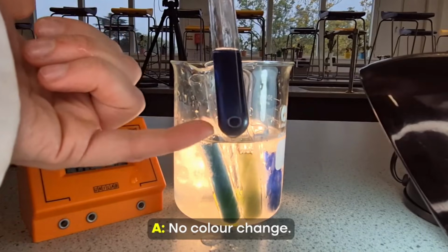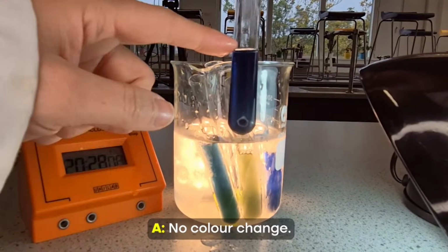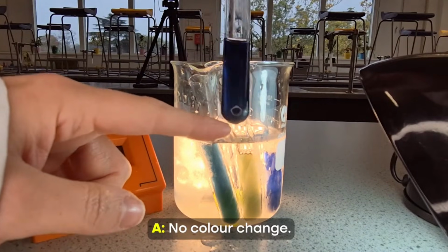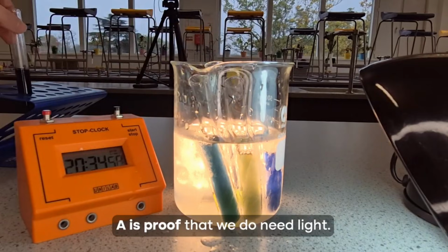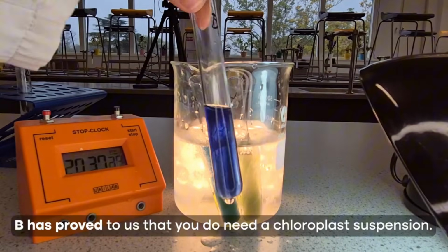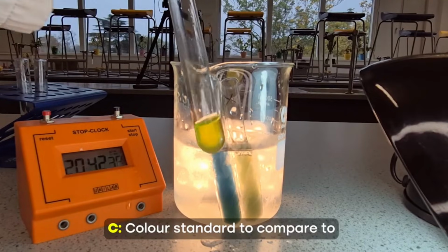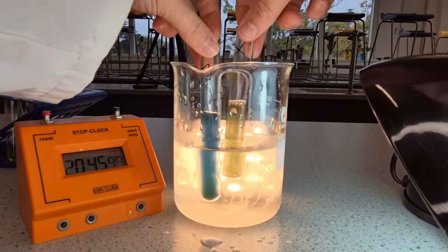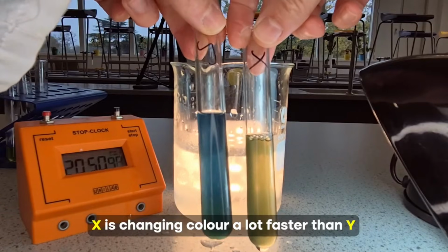It does look slightly green on the bottom, but you can make students aware that that is probably because some of the chloroplast has just settled to the bottom. It's not that the DCPIP has changed colour. So A has proved that we do need light. B has proved to us that you do need a chloroplast suspension. C was just my colour standard to compare to. And from this, we can see that X is changing colour a lot faster than Y.